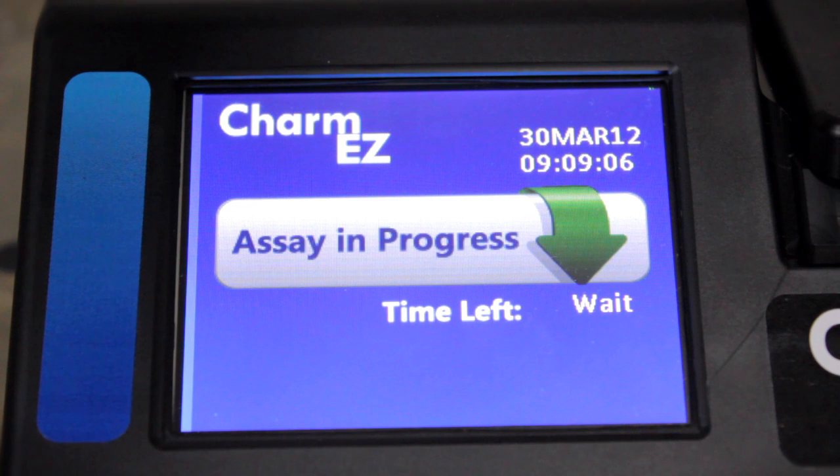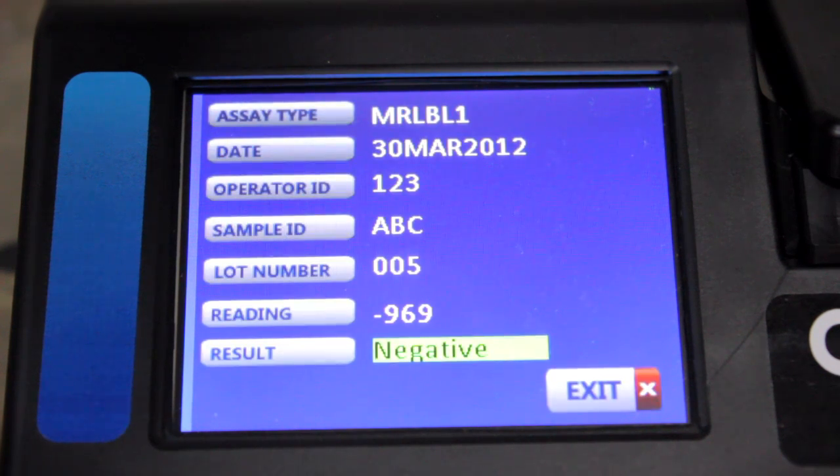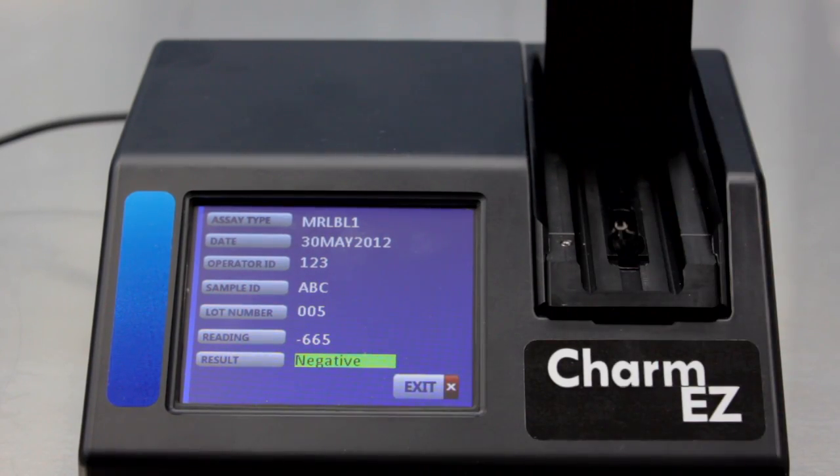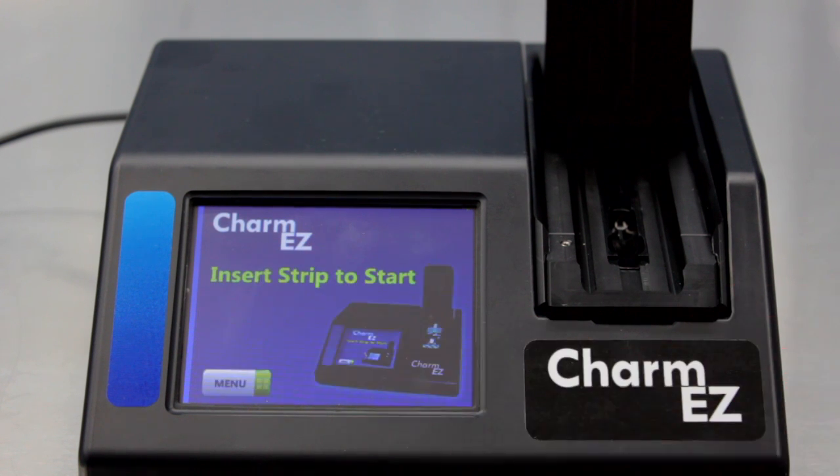At the end of the incubation period, the results will automatically appear on the screen. Open the door, remove the test strip, and press exit to return to the start screen.